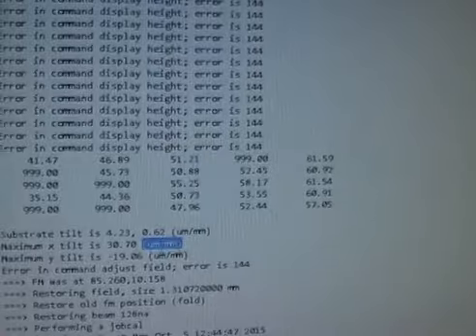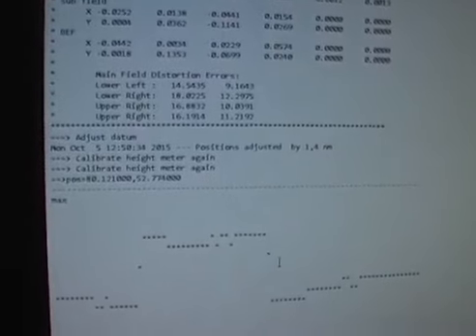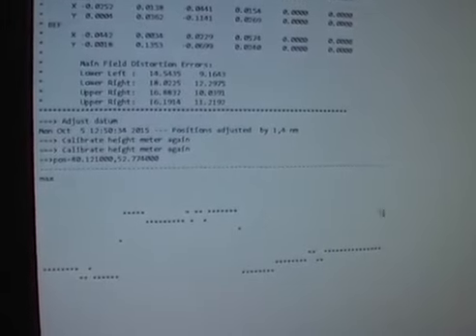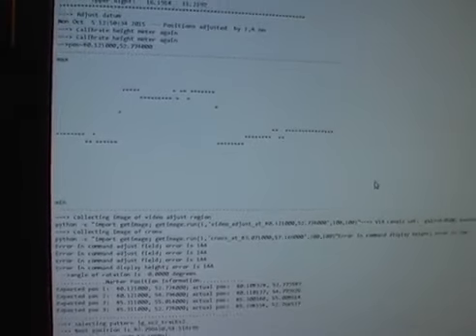That's quite a big tilt. It also gives you information such as this is when it's trying to find the marker, so this is the backscatter electron signal as it scans across the marker. So again, this is not a great marker, but that's because it's aluminium and silicon. And then it's got the actual positions of the markers, but these are all things for registration.